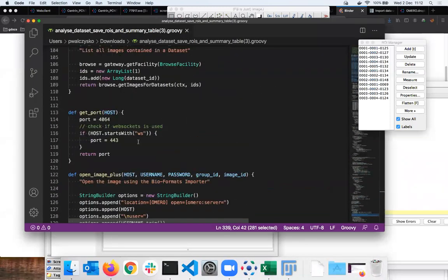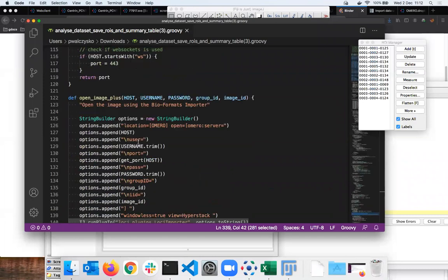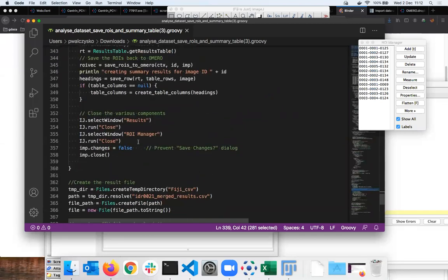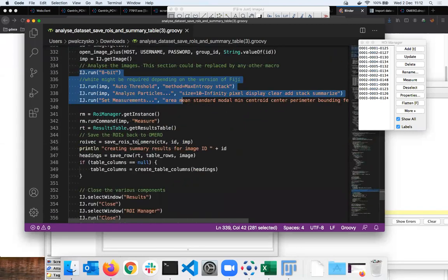No, stay where you were, Peter. Go down. No, you were at the core. I think going through the... no, what you were showing, just stick there.